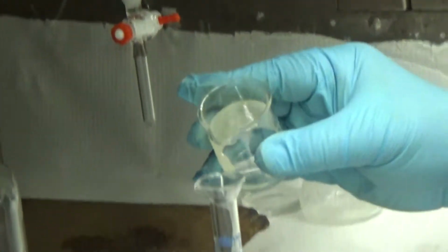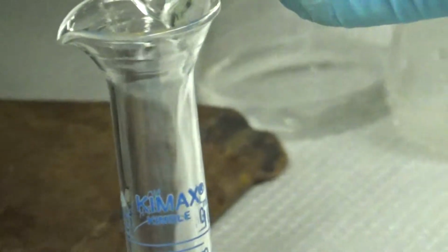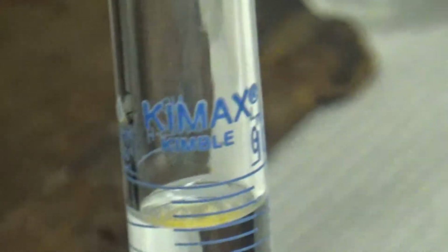So I'm going to add. That's your second extraction of dichloromethane. Second extraction, 10 milliliters of dichloromethane. Alright. And a little more.